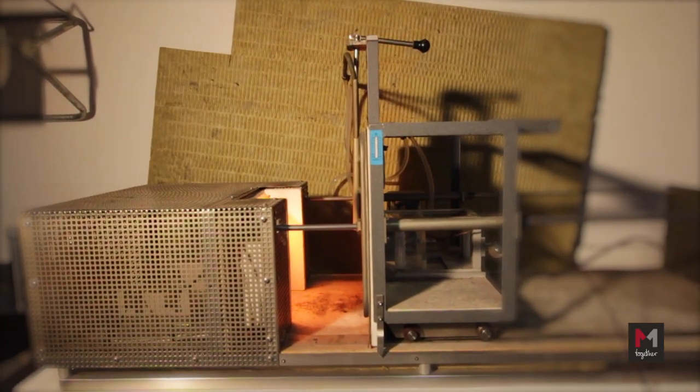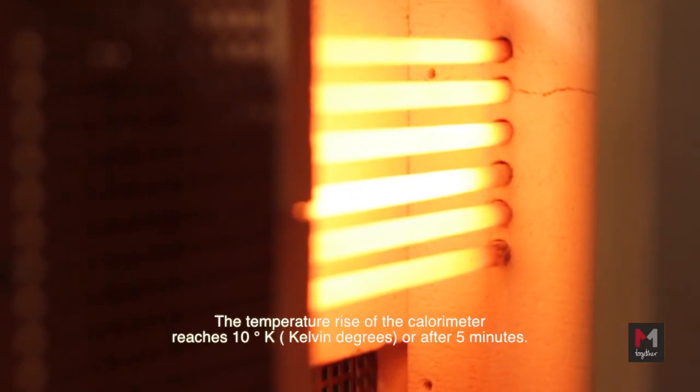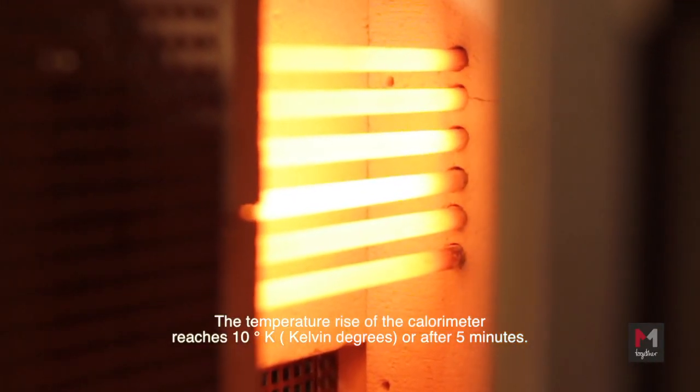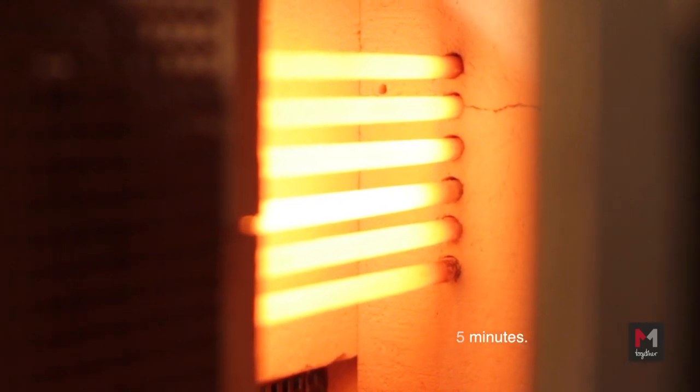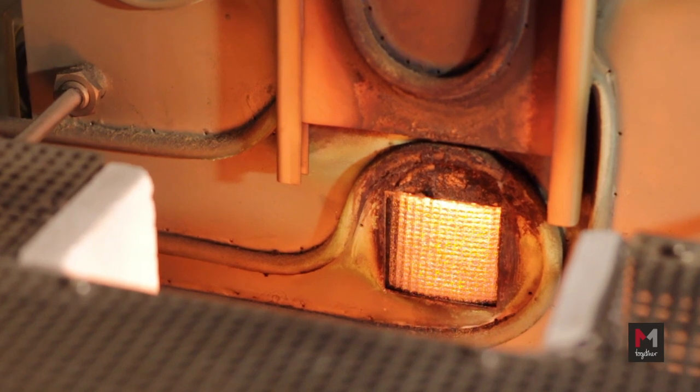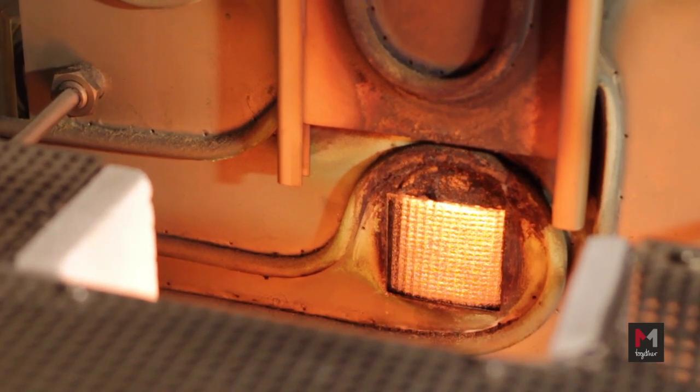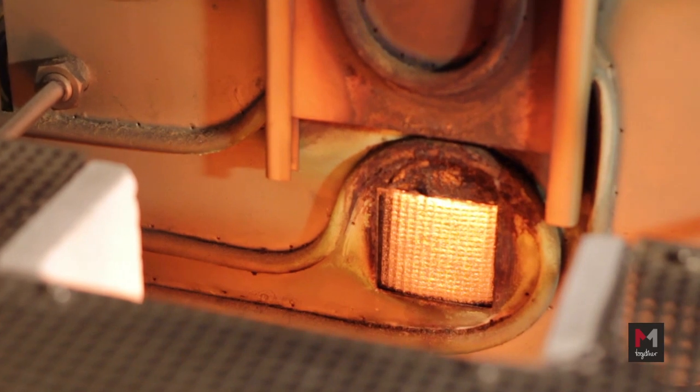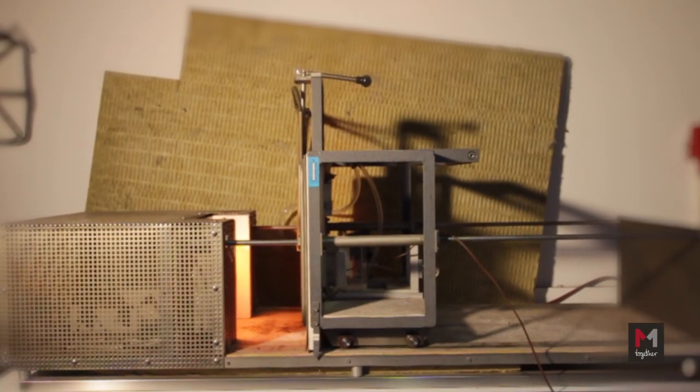The heat passing through the sample is measured using a calorimeter placed behind the fabric and in contact therewith. The heat radiation will stop when the temperature rise of the calorimeter reaches 10 degrees Kelvin or after 5 minutes. It will be measured the time needed in seconds to produce temperature rise of the calorimeter, which is the time required before a person starts to feel pain from second degree burns caused by radiant heat.